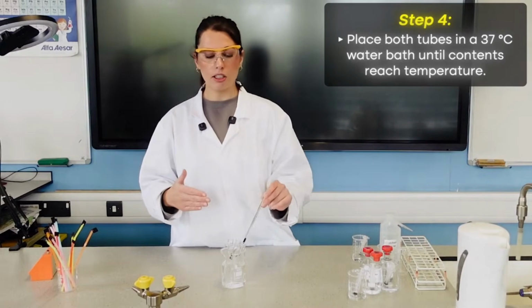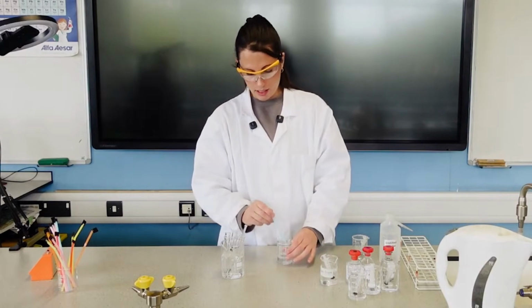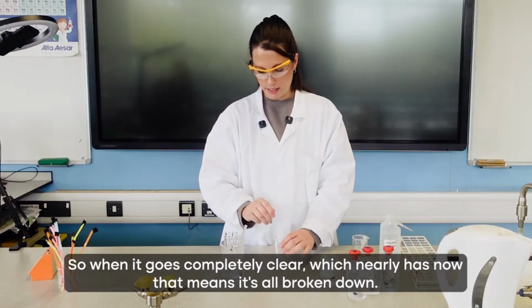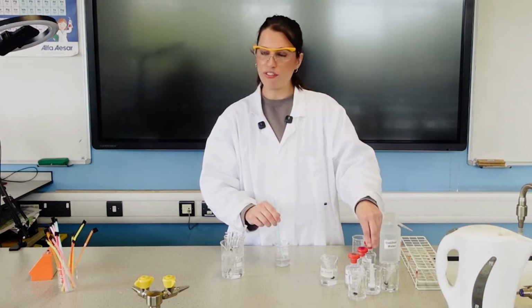So this experiment is the enzyme is breaking down the gelatin in the photo film, which is what makes it black. So when it goes completely clear, which it nearly has now, that means it's all broken down, but we're using different pHs to show that pH effects.